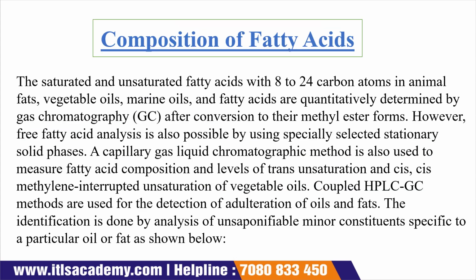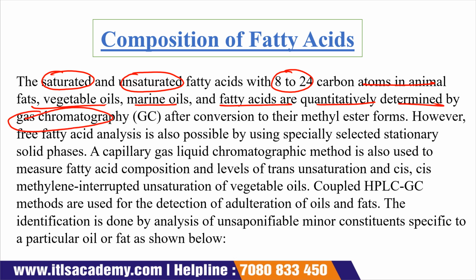Now, composition of the fatty acid. Either saturated fatty acid or unsaturated fatty acid, both contain carbon atoms, 8 to 24. In animal fat, vegetable oil, and marine oil, fatty acids are quantitatively determined by gas chromatography. Okay, so either it is saturated fatty acid or unsaturated fatty acid, both contain 8 to 24 carbon atoms.